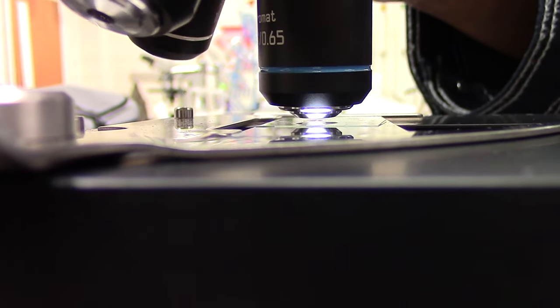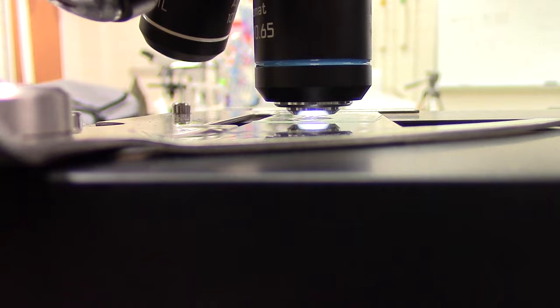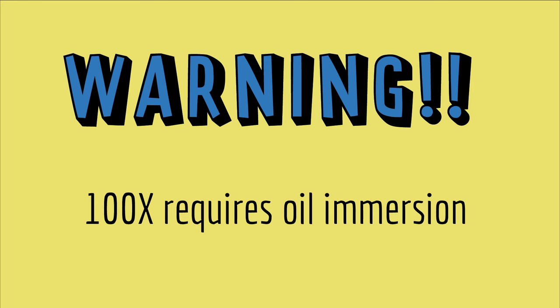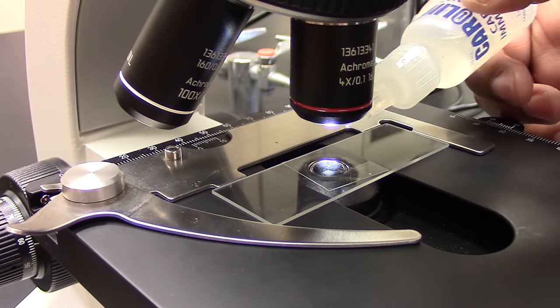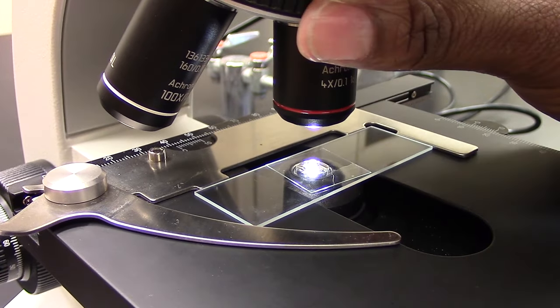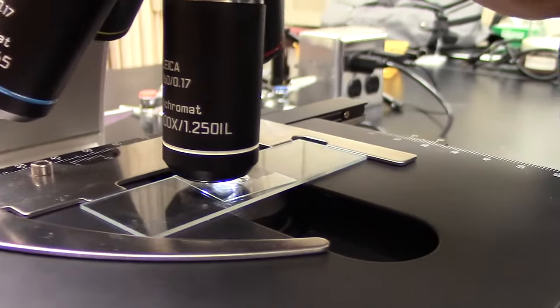The higher the magnification, the more light you'll need. You can adjust the light levels using a knob on the side of the microscope. If you need to use the 100x objective, you'll need to use oil immersion — I'll cover how to do that in another video.